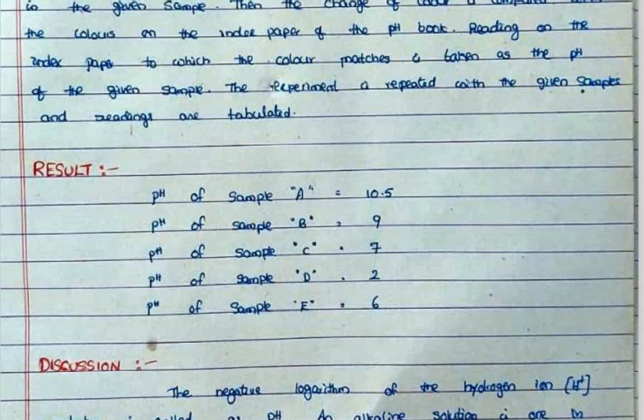Okay, so the experiments already written down are the salt experiment, oxygen experiment, carbonate experiment and bicarbonate experiment, after that pH values.